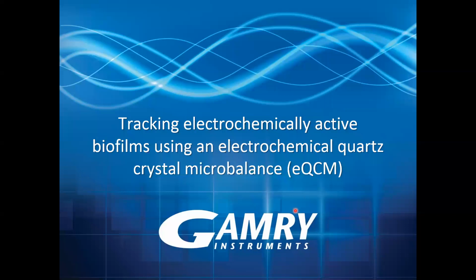So I'll just start with why biofilms, why is Gamry even talking about biofilms? Well, I think that electron transfer in biofilms as a whole is an emerging field. I think everybody has known about it, but the methods to study electron transfer in biofilms have really been taking off in the past couple of decades.